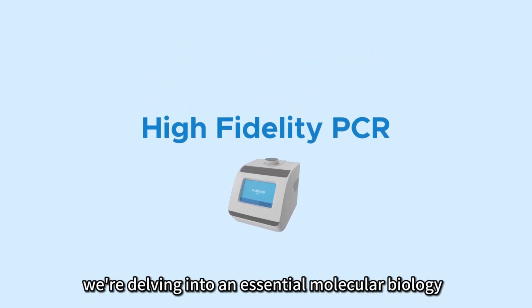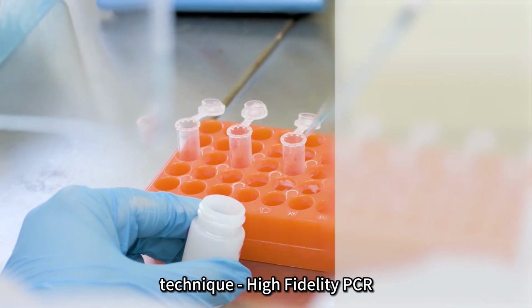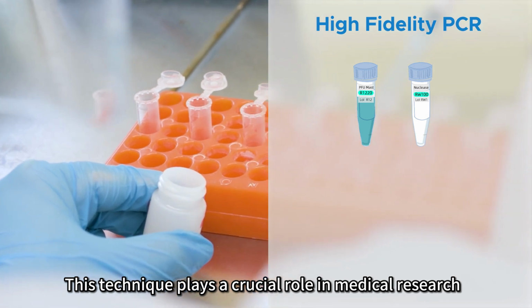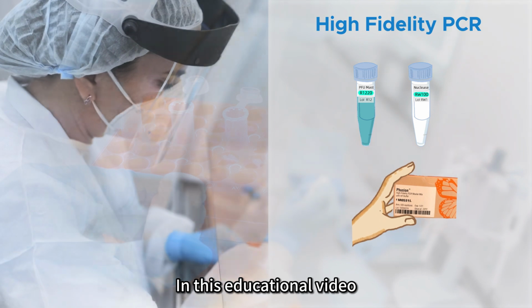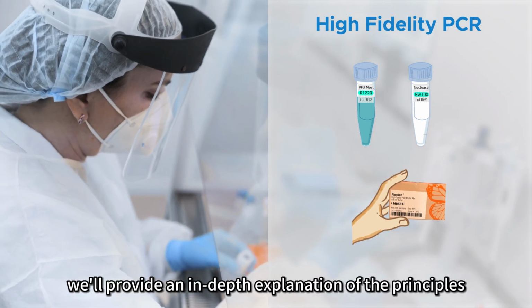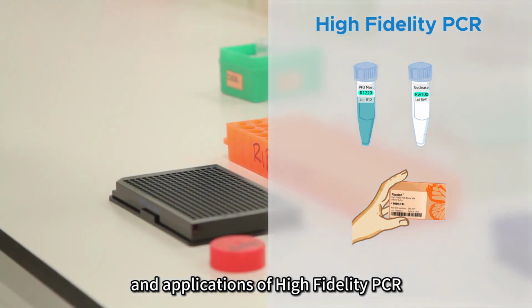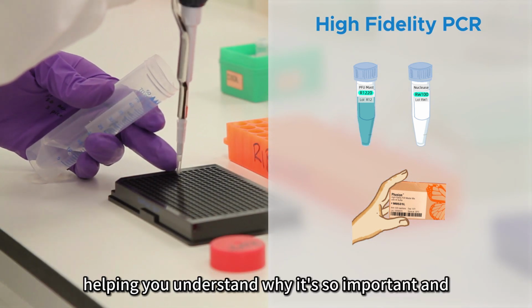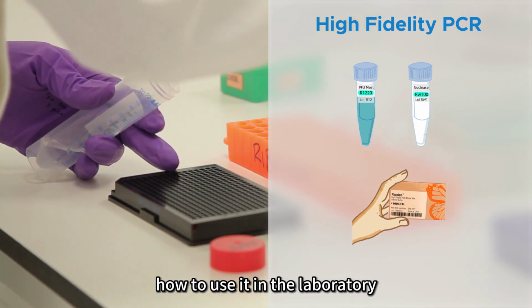Today we're delving into an essential molecular biology technique, high-fidelity PCR. This technique plays a crucial role in medical research and diagnostics. In this educational video, we'll provide an in-depth explanation of the principles and applications of high-fidelity PCR, helping you understand why it's so important and how to use it in the laboratory.